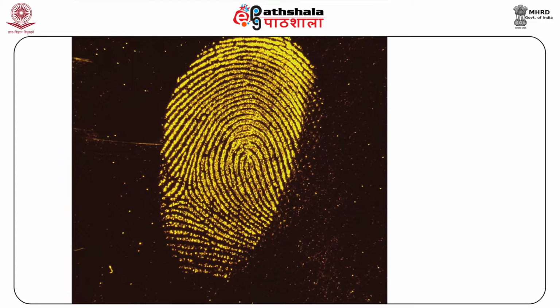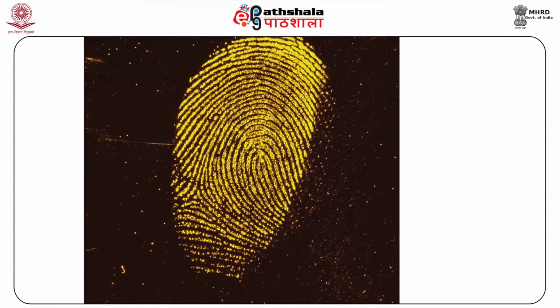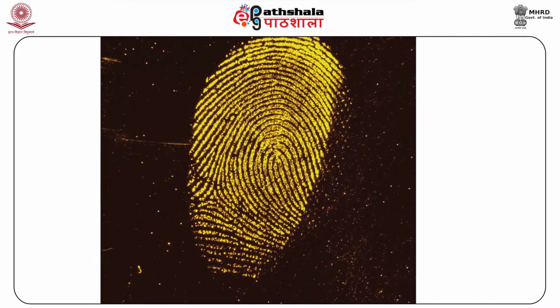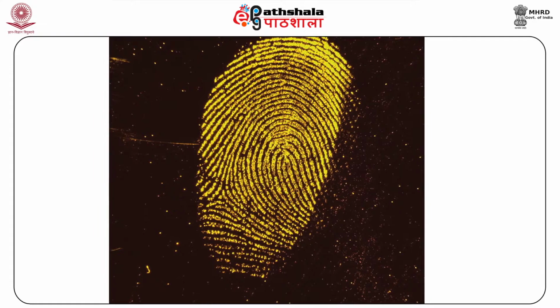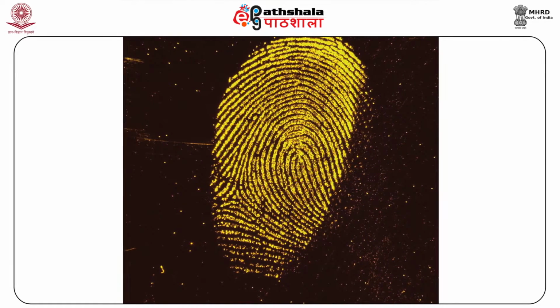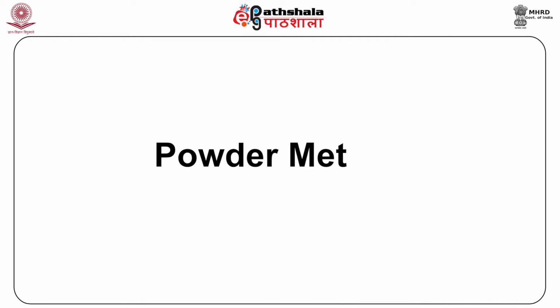Now, let us have a look at post-treatment of developed fingerprints with luminescent materials. In this procedure, the finger impression is treated with a laser active substance which becomes physically adsorbed on the sweat residue. When illuminated with laser light, the ridge pattern produces a contrast against the background. Number 1 is the powder method.